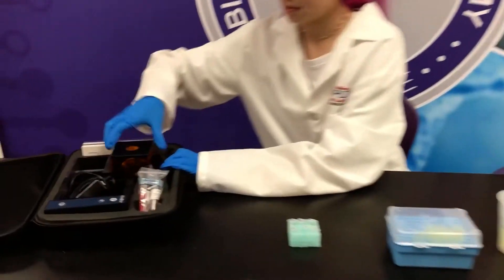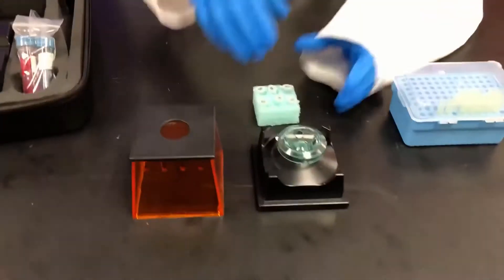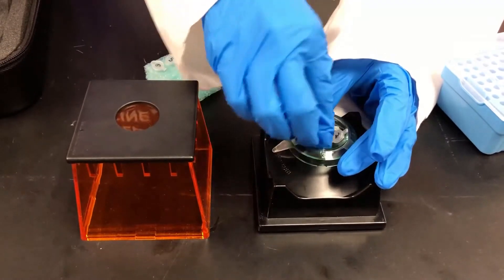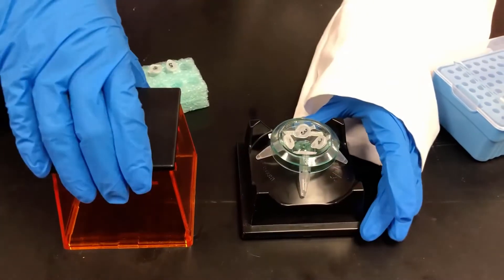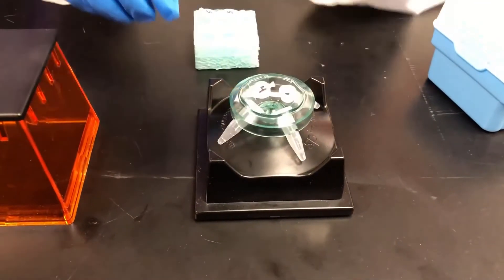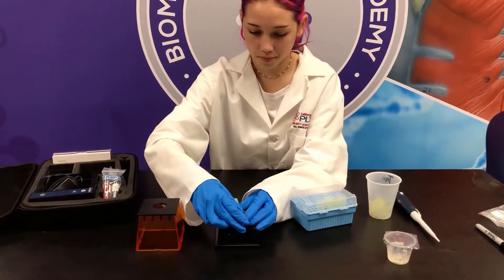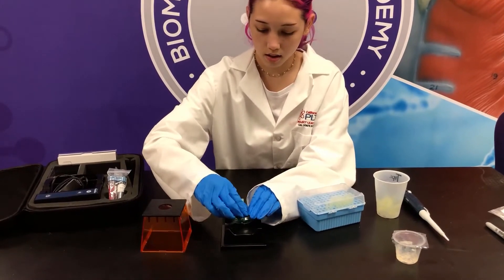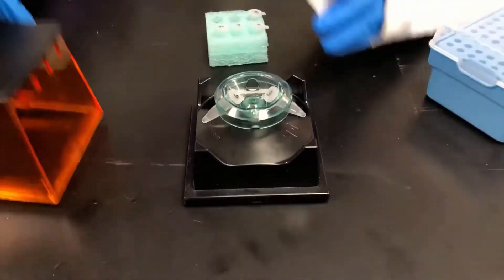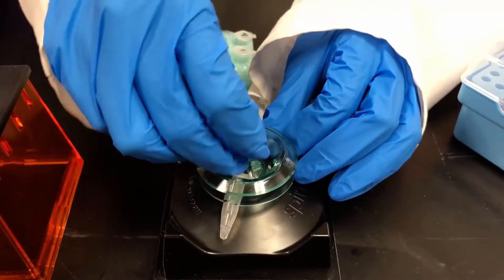Now I'm going to get out the centrifuge and I'm going to turn it on. I'm going to put the first four tubes in and make sure they're balanced, and then I'm going to centrifuge it for about 15 seconds. Now I'm going to take them out, put them back, and then I'm going to put tubes five and six in and do the same thing, then put them back.